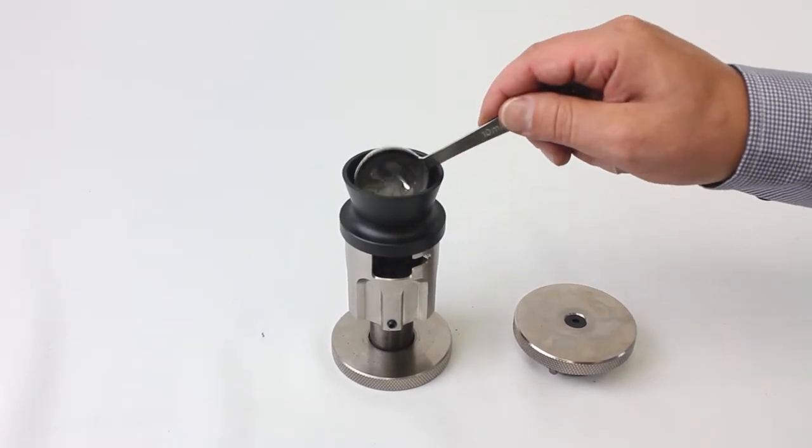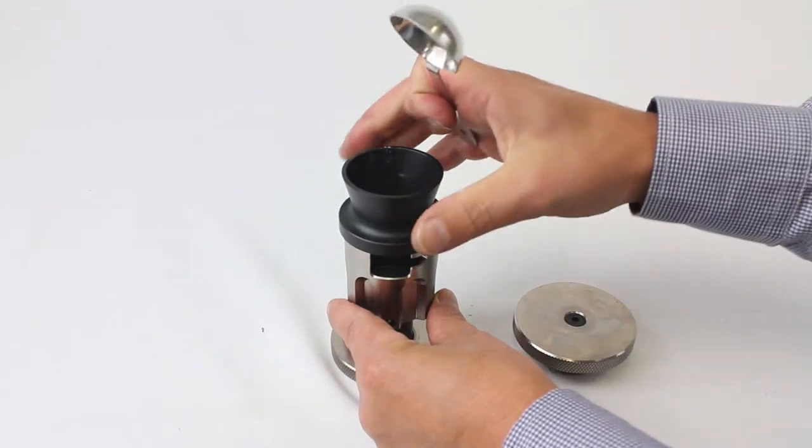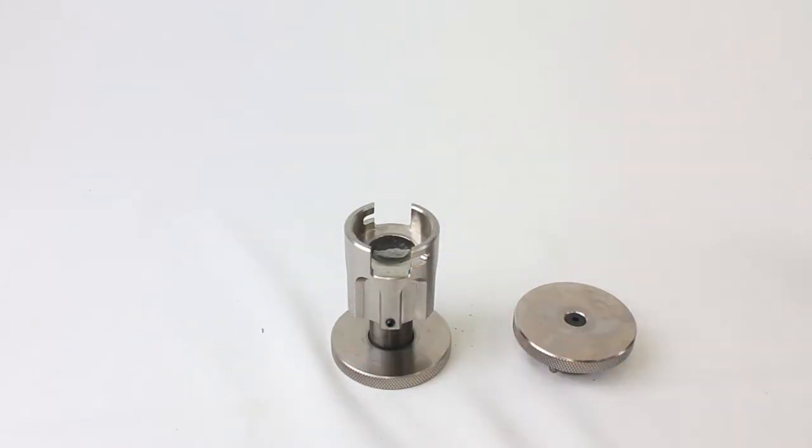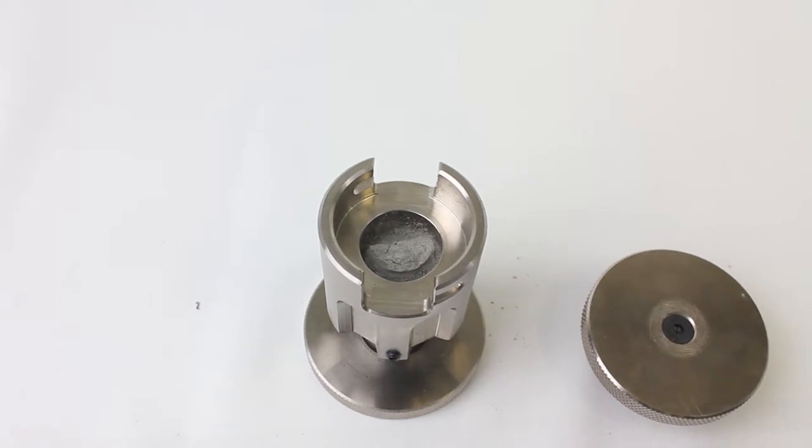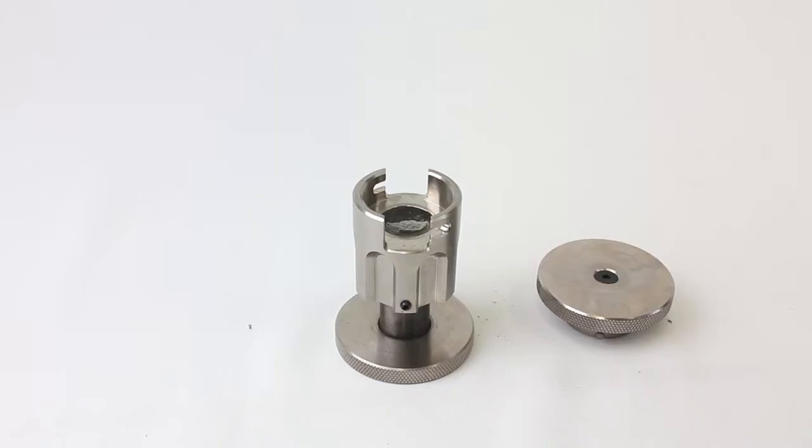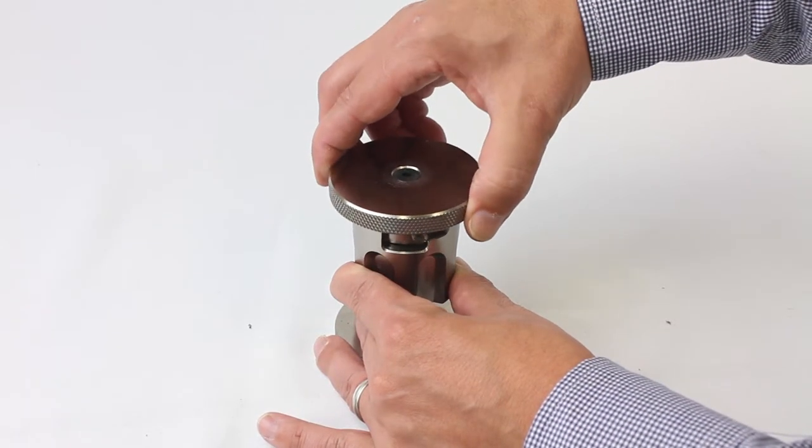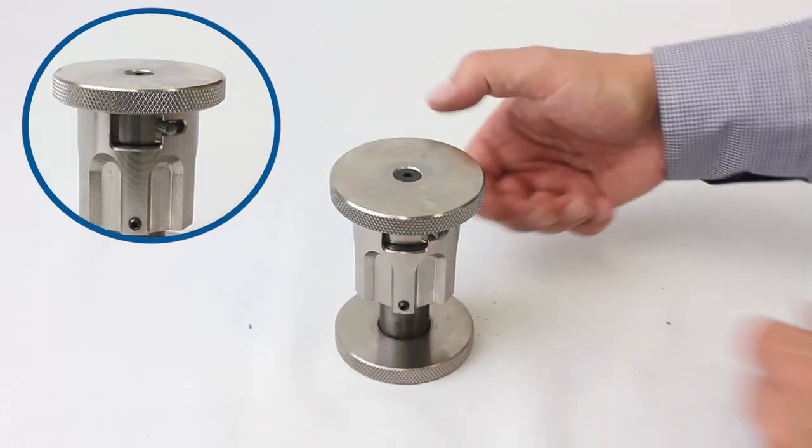A dry, fine powder will produce the best results. Introduce the sample to the funnel. If bridging occurs or the sample does not flow completely into the die, tap the funnel and/or die body lightly. When using the standard sample die, the volume is less critical because it is possible to produce pucks of varying thickness.